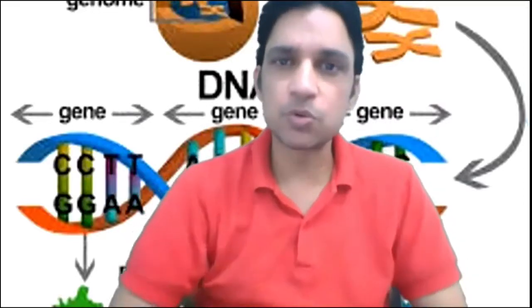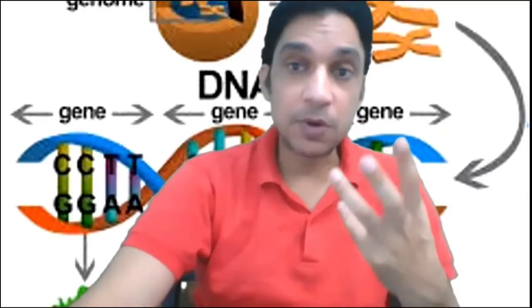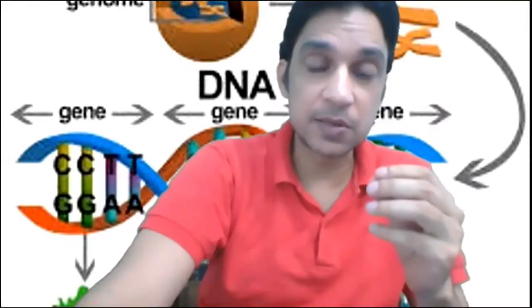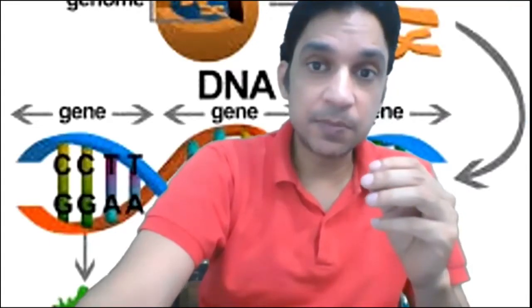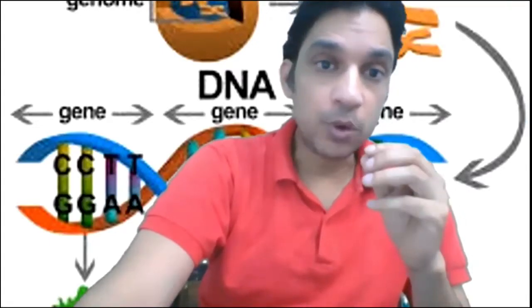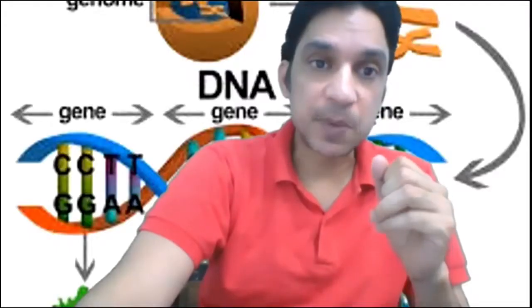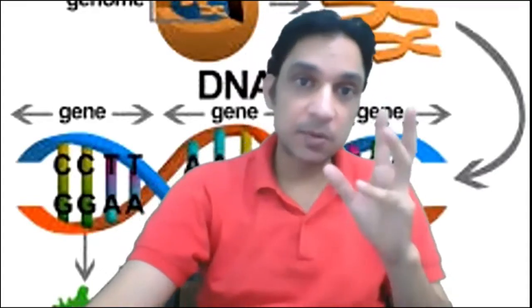Let me go through those slides quickly because I don't need to spend much time, since we have covered the most fundamental aspect of the lecture, and that is the mechanism of PCR reaction and what is the factor behind the specific amplification of a specific PCR product.